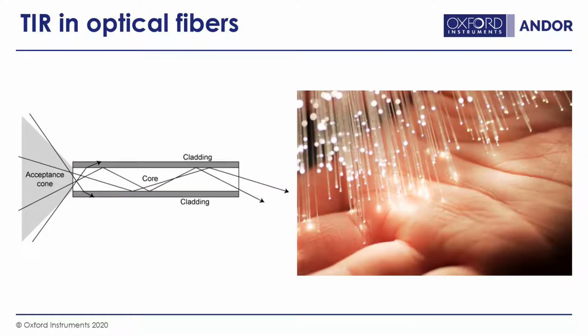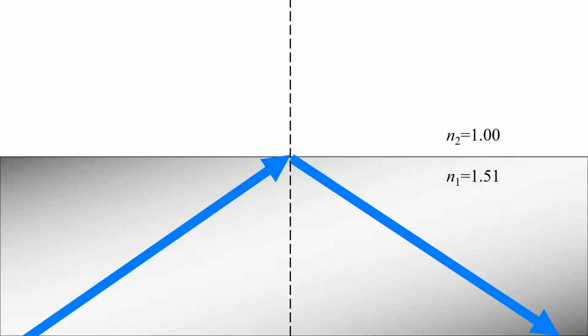Total internal reflection also explains how and why optical fibers are able to transmit light over great distances with little to no power losses. But what you learned in basic high school or university physics is actually a very simplified geometric optics view of what happens when light internally reflects at an interface. What occurs at the point of contact where the incident laser beam strikes the interface and subsequently completely reflects back into the high-index optical medium?